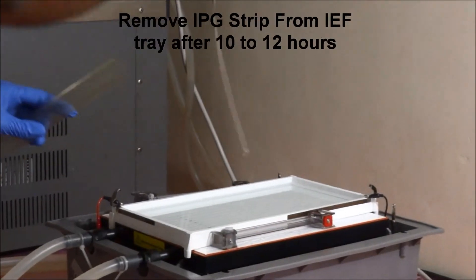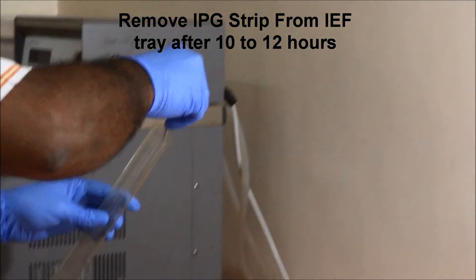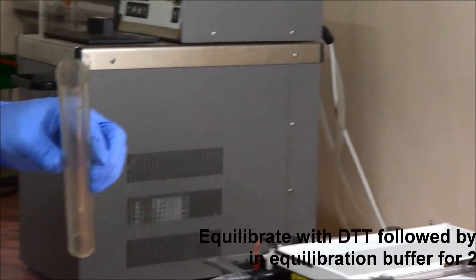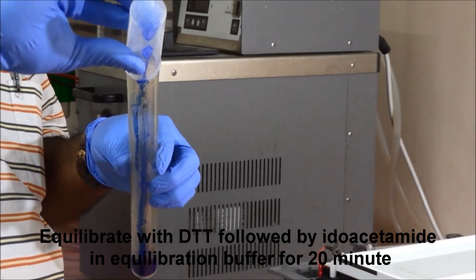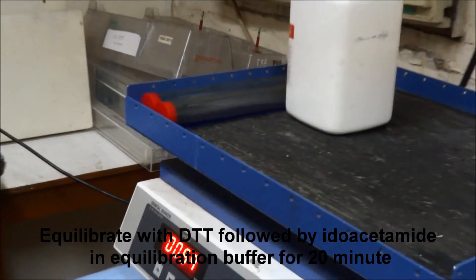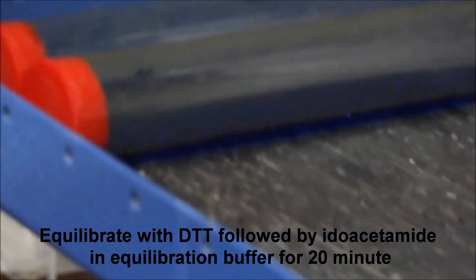Remove the IPG strip from the isoelectric focusing tray after 10 to 12 hours. Equilibrate with DTT followed by iodoacetamide in equilibration buffer for 20 minutes.